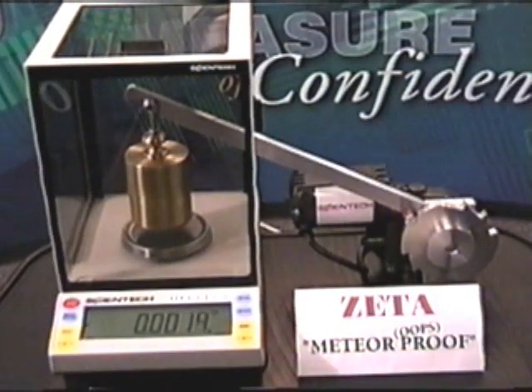We are dropping a two kilogram weight onto the weighing pan from a height of about 25 to 37 millimeters.